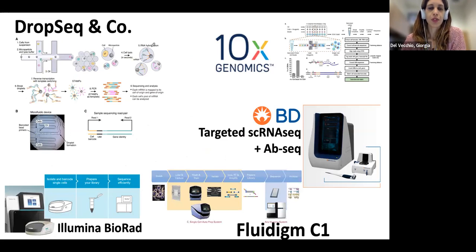Okay, let's now move to the single cell. When we talk about single cell, the main approach is still the droplet. The Drop-Seq was the first single cell technique, but even 10x or the Illumina Biorad, so even those more recent instruments, are based on the same principle.